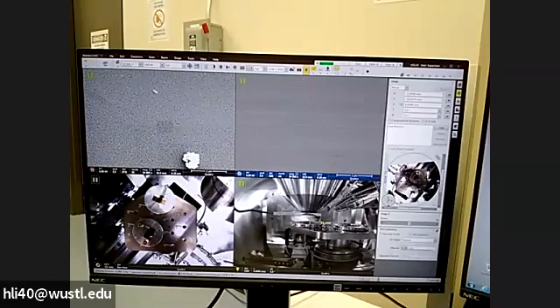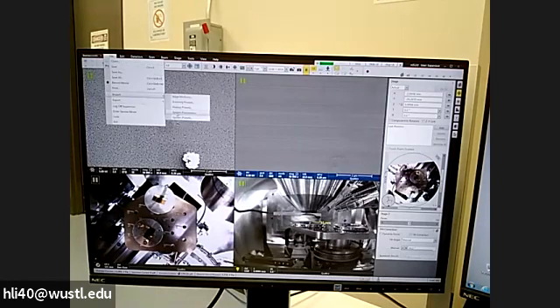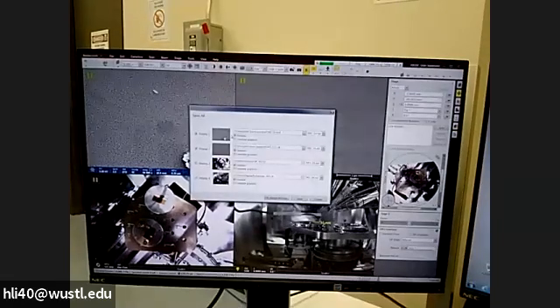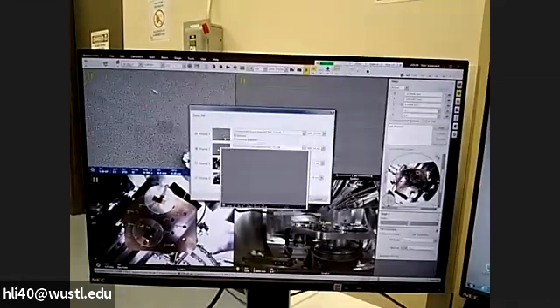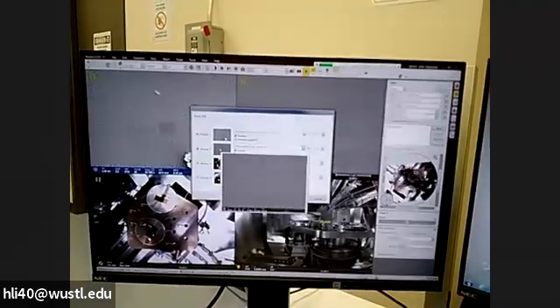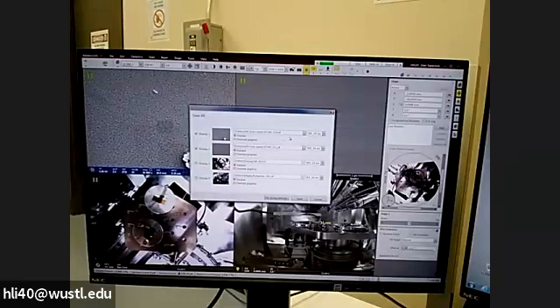After you finish the whole frame scanning, it will stop blinking, and then you can go to File, go to Save All, or if you only have one image, just Save As. But make sure you highlight the image you want to save. Okay, make it blue. If you want to save all, just click Save All. When you save all, this is also good for you to have a preview. You put the mouse on the image, it will show you. I think it's a new feature.